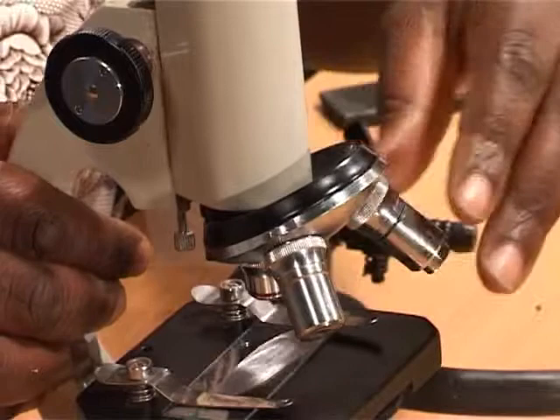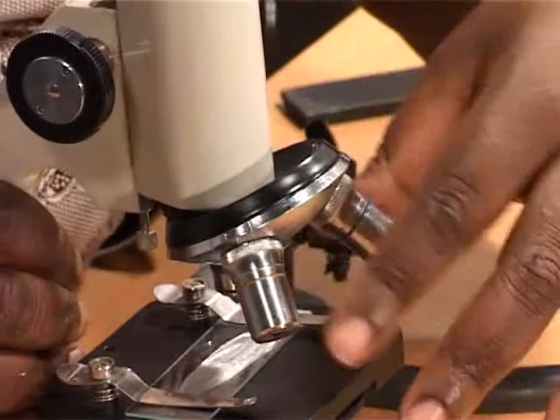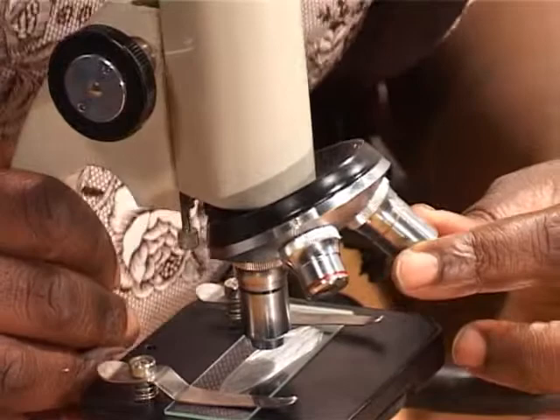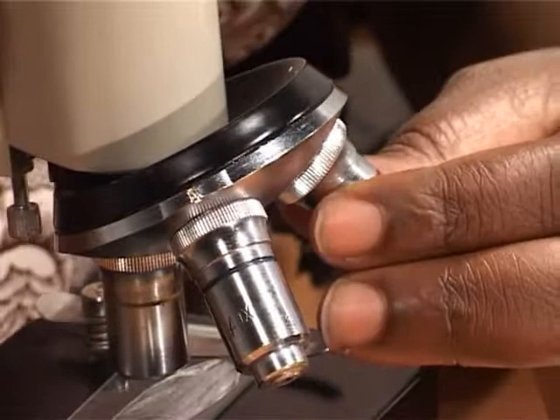For example, we start with the objective lens here, it is written 4 times. So it is saying it magnifies 4 times. Okay? If this is the power, you turn the turret and check the other lens. Okay, you turn and you check. This one is saying times 10, so this one magnifies 10 times. We have a small one here. Let us look at how many times it magnifies. This one is saying 4 times.